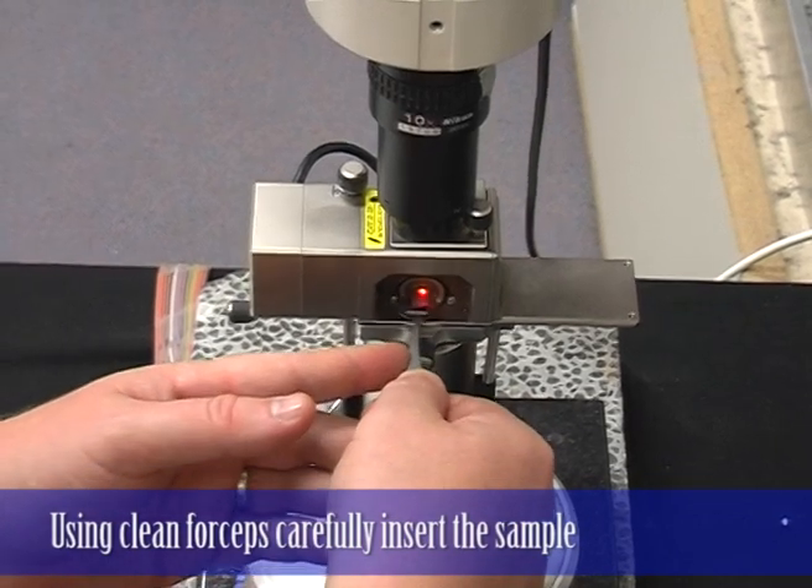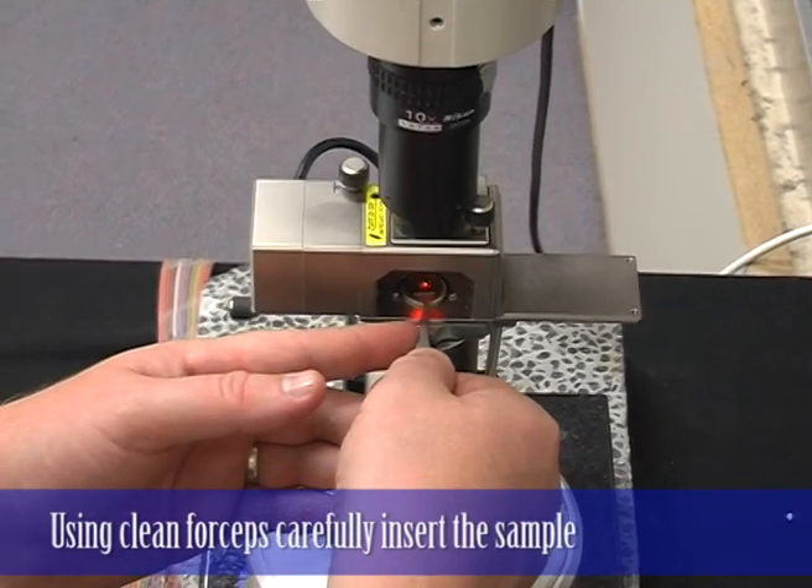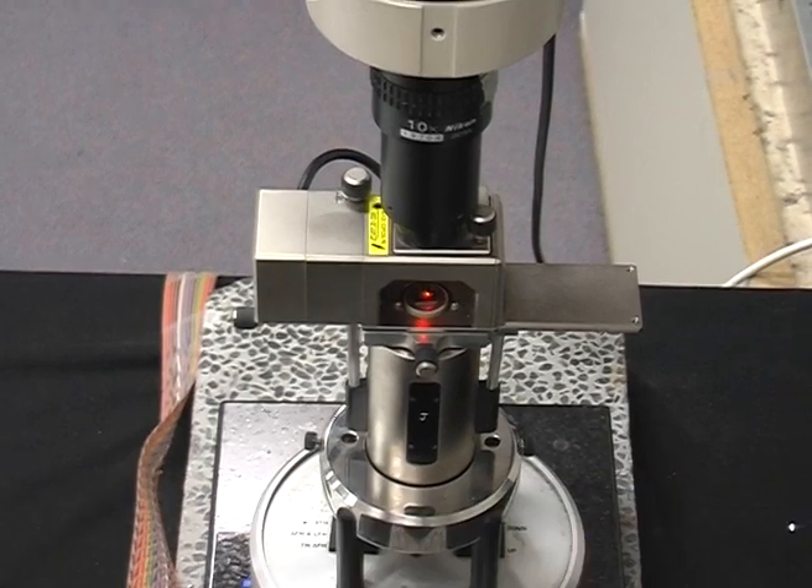The top of the scanner is magnetic, so we very carefully lower the sample.